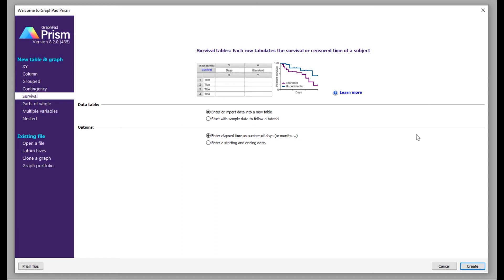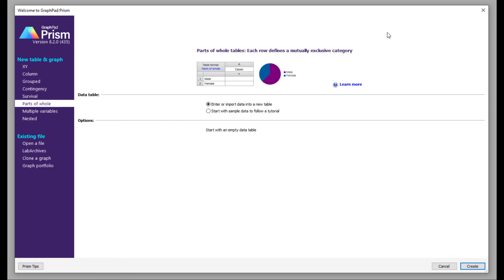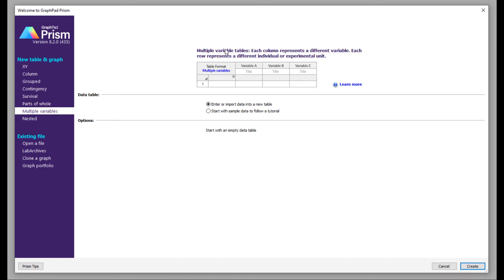You can use the survival setting to plot your survival data. If you are interested in pie charts, there is a setting available called parts of whole, which lets you express your data in the form of pie charts. The multiple variable table provides a format where each column represents a different variable and each row represents a different individual or experimental unit.